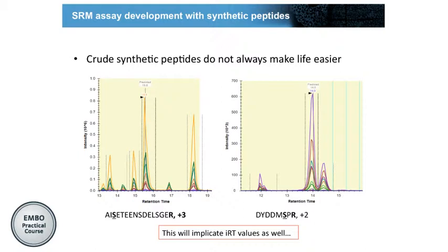This, for example, when we go in a circle around, methionine will create a mass difference. So proline. Proline can isomerize, and when you synthesize a peptide, it can come as a cis or a trans. This affects retention time, but it's exactly the same mass. There is no way of separating them by mass.